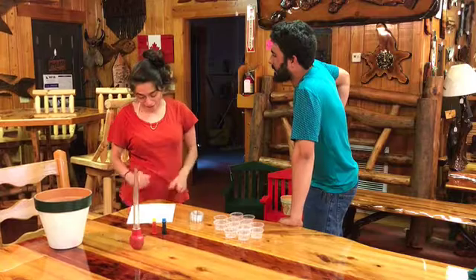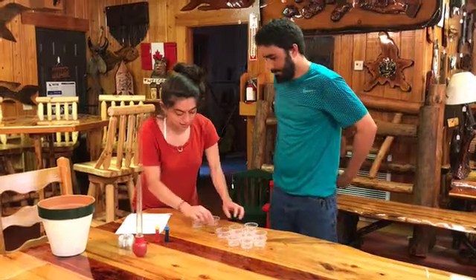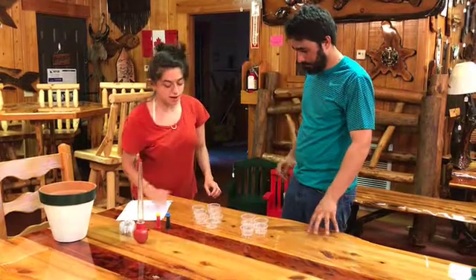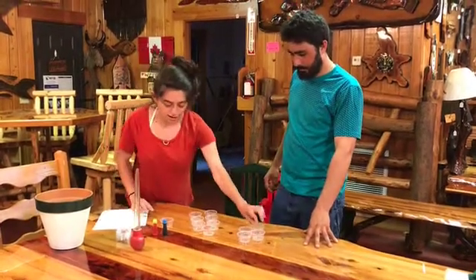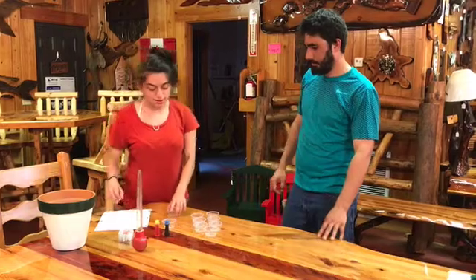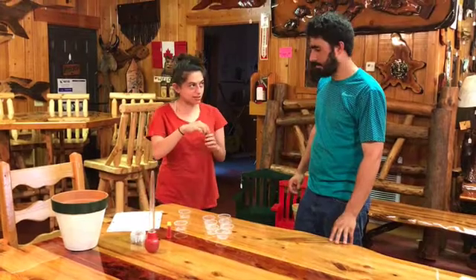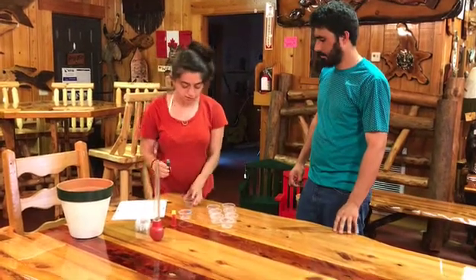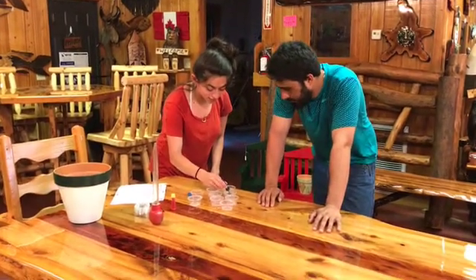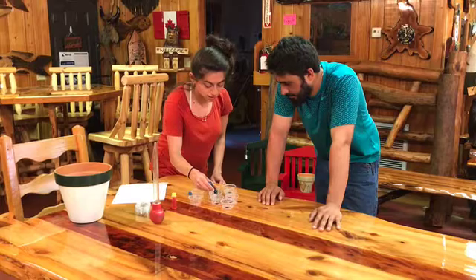Right, well, continuing on, so we have 7 cuvettes, and these are going to have the standards. Then we have 1 which will be a blank, and 1 which will be for our sample. And so the first thing that we're going to do is add the Bradford reagent to all of our cuvettes. So we add our Bradford reagent. How much? 1 milliliter in each cuvette.